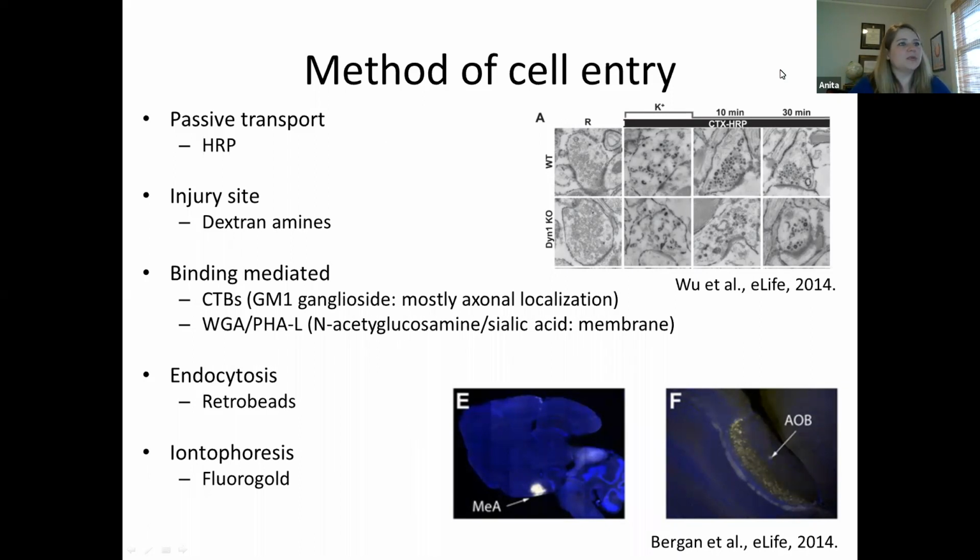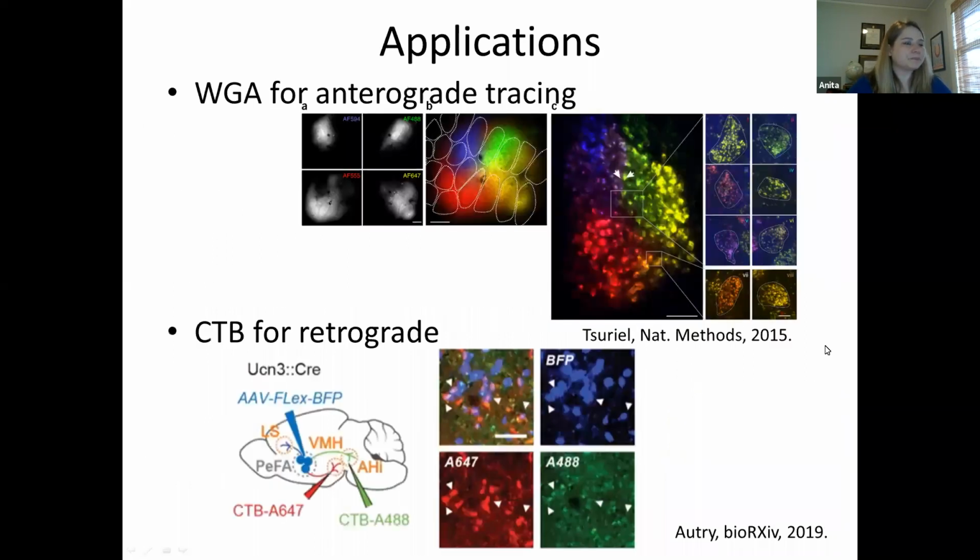So the reason I put this on here is that this gives you kind of a framework for why something might be anterograde or retrograde. And we're going to talk about that too in terms of the viruses, why they go certain directions. And as long as you know that there's something you can look up, anything that you're working with, you can look up how it enters the cell, and you can figure out whether it should be anterograde or retrograde.